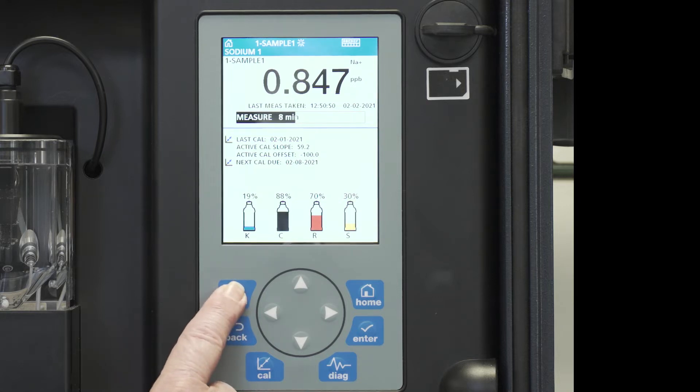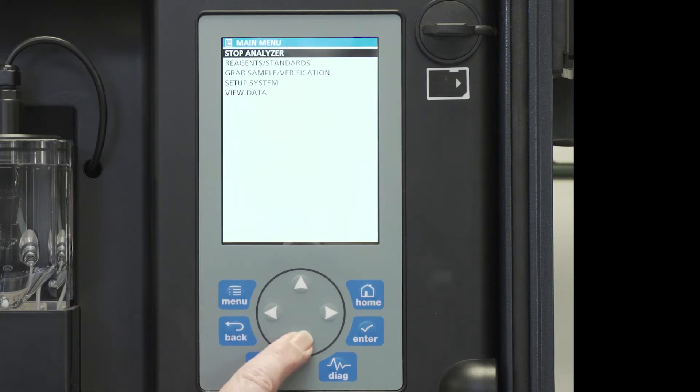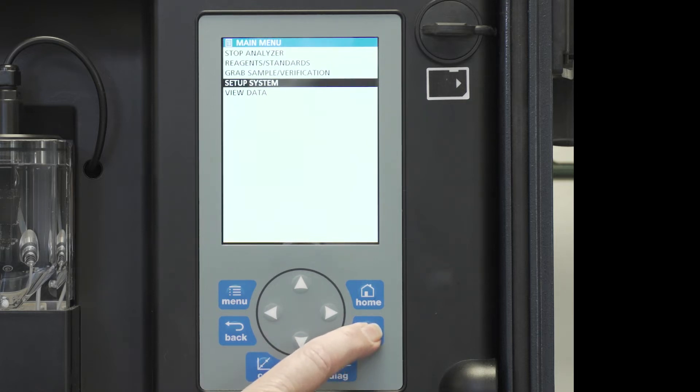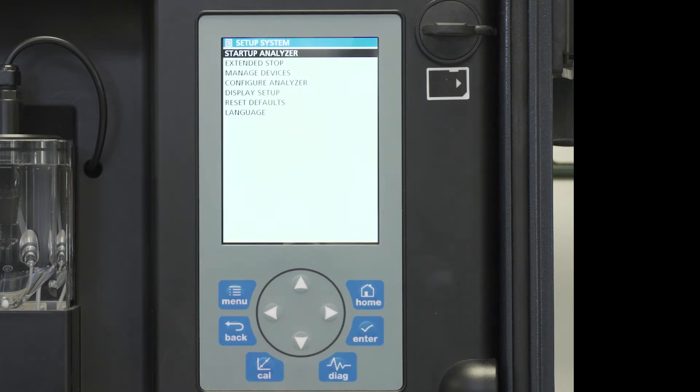We will go to menu and scroll down to system setup. Press enter, move down to configure the analyzer.